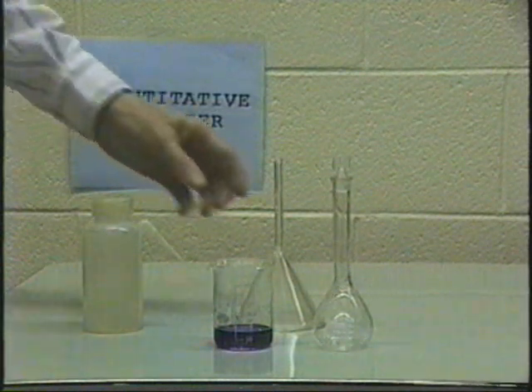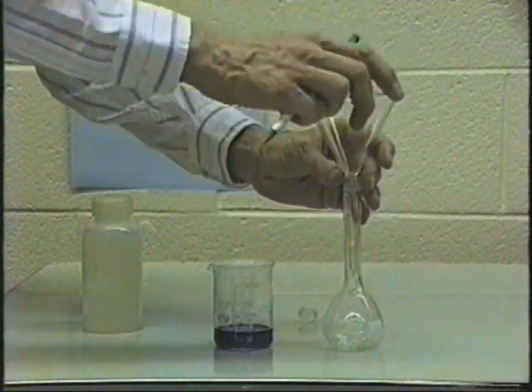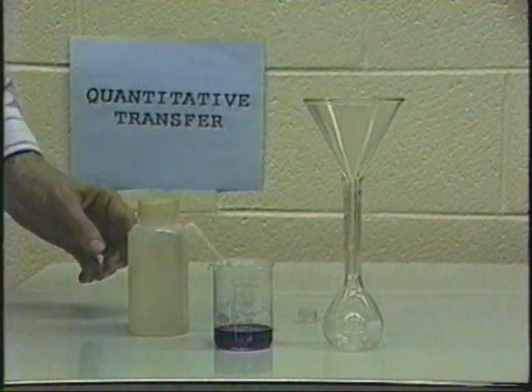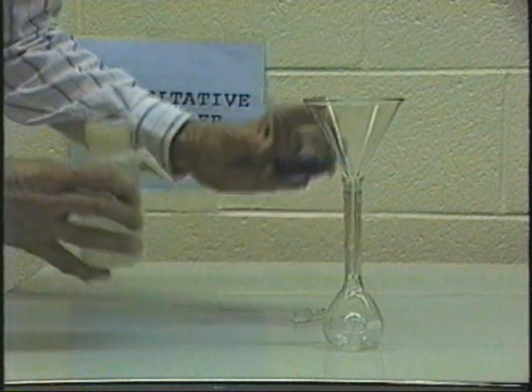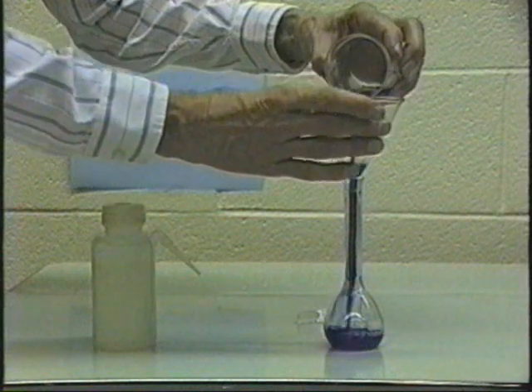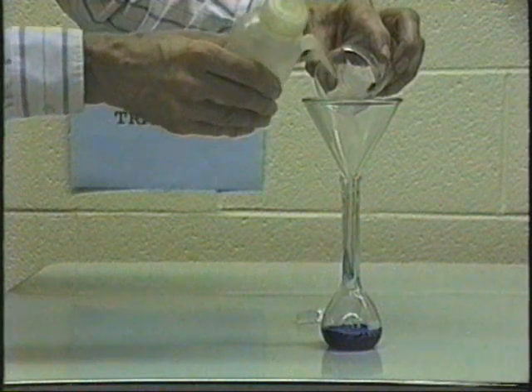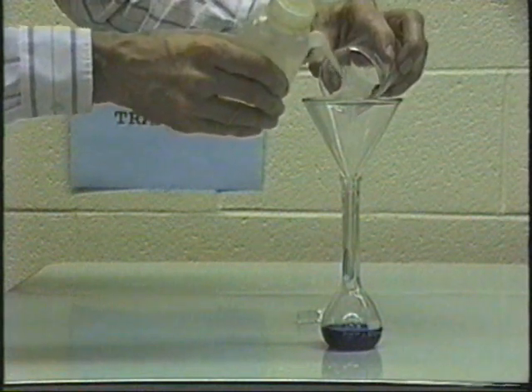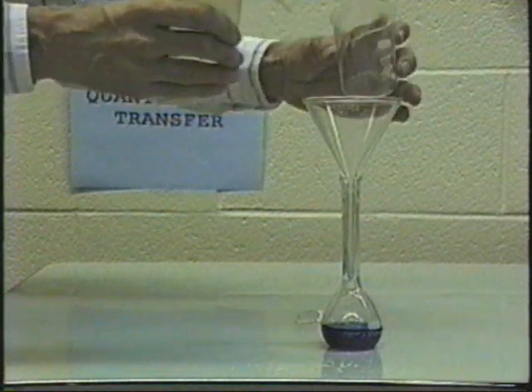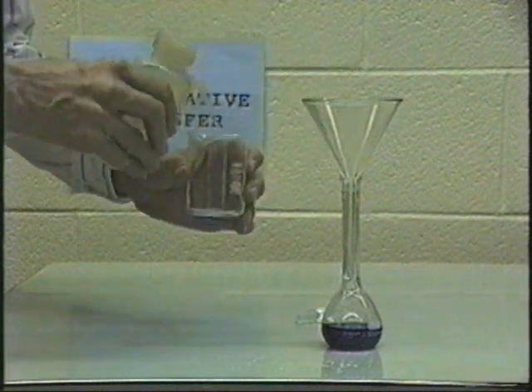To do this, you will use a funnel and a wash bottle, and the wash bottle is filled with distilled water at room temperature. Then you'll take your solution and pour it in, but do this carefully so nothing splashes out. And don't tilt it back until you rinse off the lip so that you make sure that all the solution that's at the lip is nothing but distilled water. That way, if anything runs down the side of the lip, it'll be distilled water rather than copper.